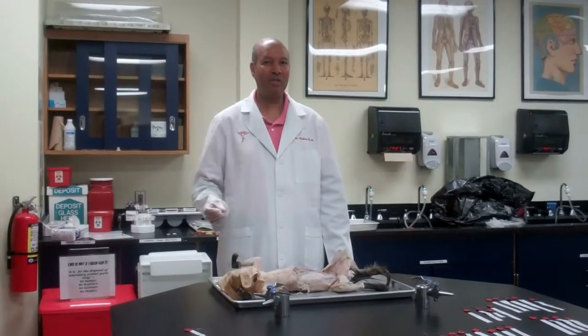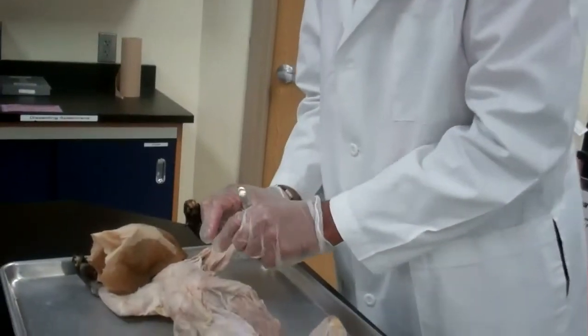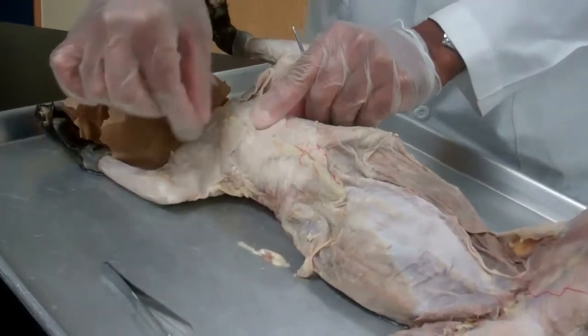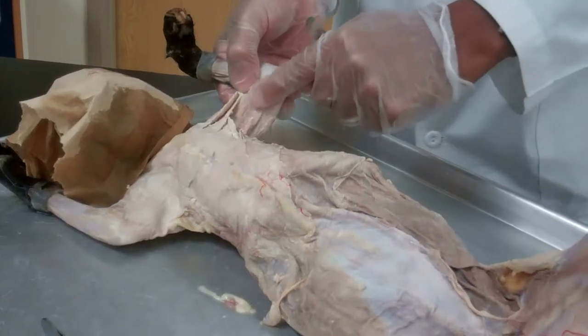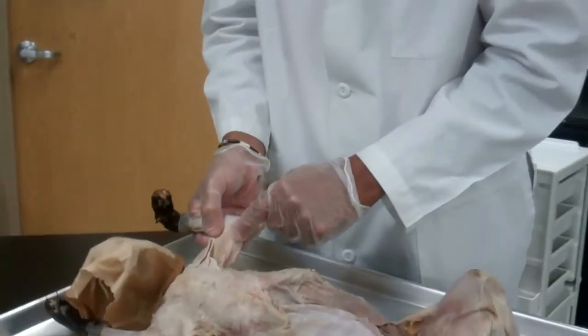Hi, today I'm going to show you how to dissect some of the cat muscles. Pectoralis. You're going to see a lot of fascia, so your cat's going to look just like this side right here. You have to peel off all of this fascia first, and once you peel off the fascia, they'll start looking like this. You'll be able to see the muscle. The fascia is the tissue that connects the muscles.